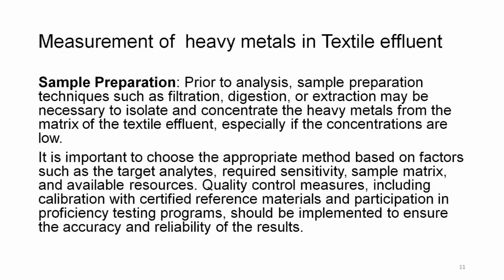Sample preparation. Prior to analysis, sample preparation techniques such as filtration, digestion and extraction may be necessary to isolate and concentrate the heavy metals from the matrix of the textile effluent, especially if the concentrations are low.